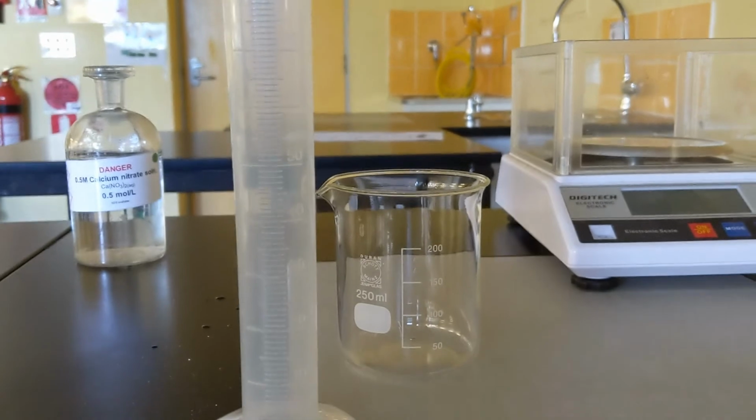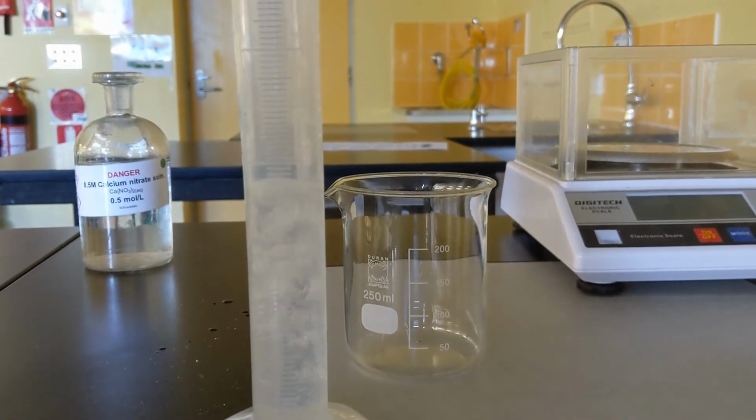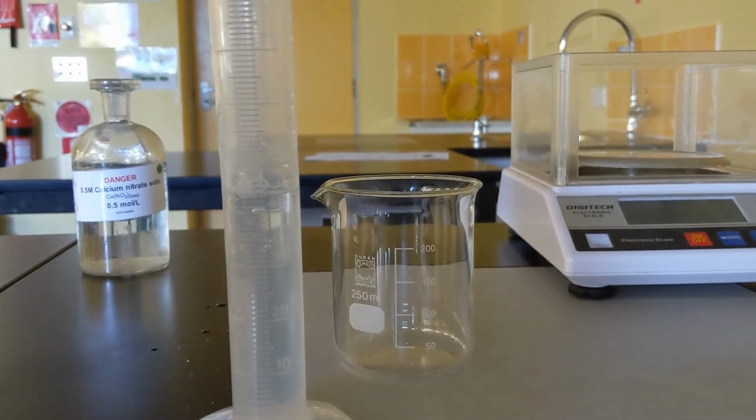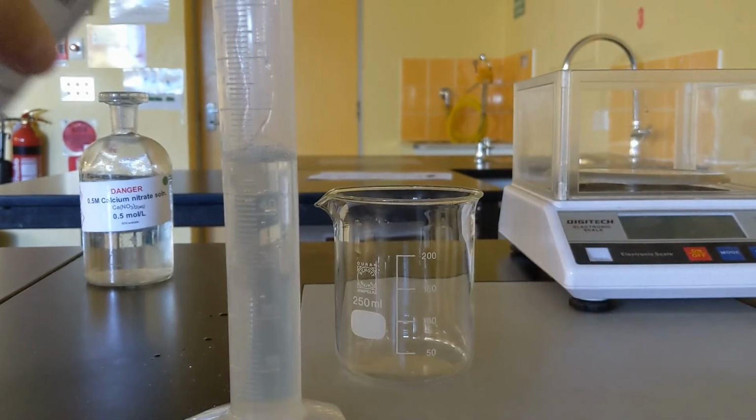Again, notice that I've put myself and the camera about level with the 50 mL mark. Just falling a little bit short. Give me a sec. So I think it was a little bit over, but we're not too worried about the accuracy of our volume measurements. The mass is much more important because we are doing gravimetric analysis. So as long as we have an approximate volume, we're completely fine.